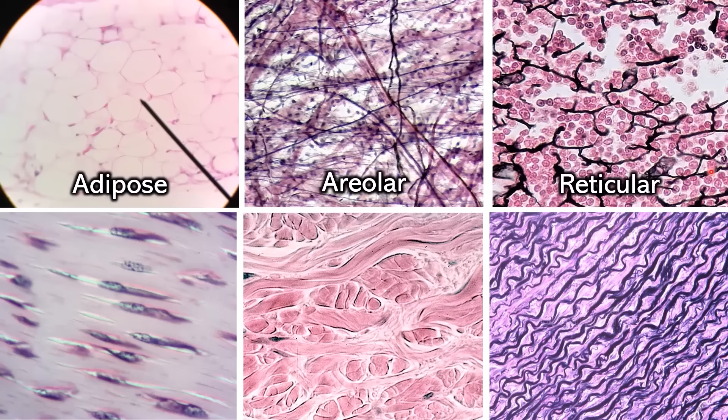All the ones on the top are loose connective tissues because they're not packed as densely — they don't have as much collagen. If we go down to the bottom, now this is a dense connective tissue. You see the fibers are stained a light pink. The fibers are all going in one direction and the cells are kind of smushed in between the different fiber bundles. This is dense regular connective tissue.